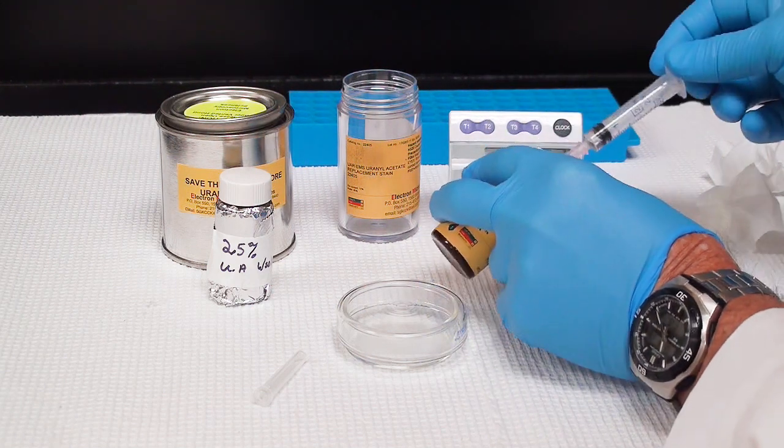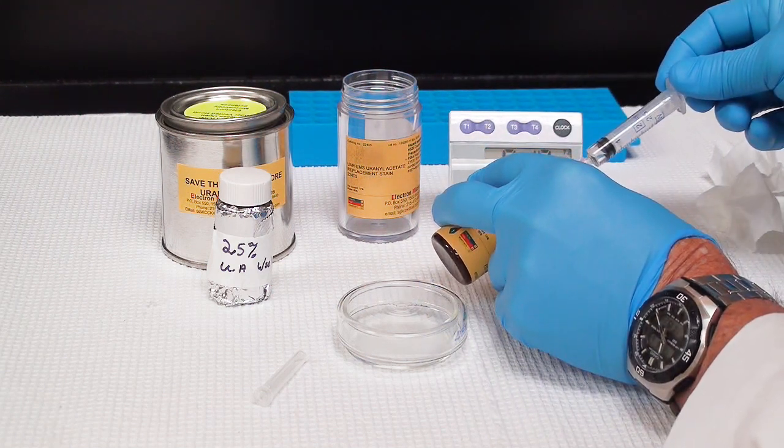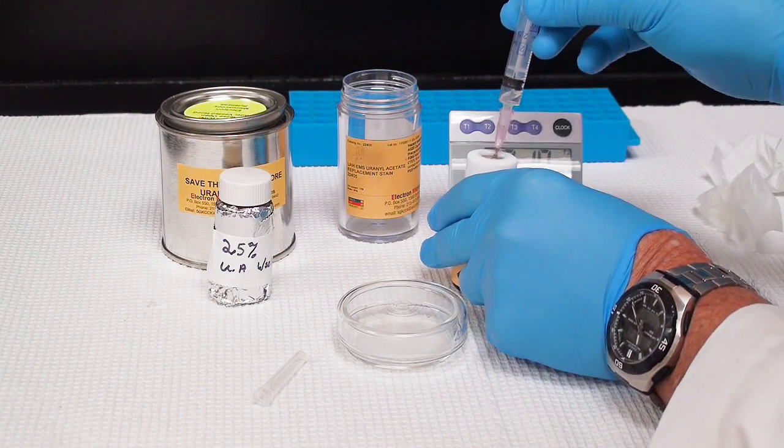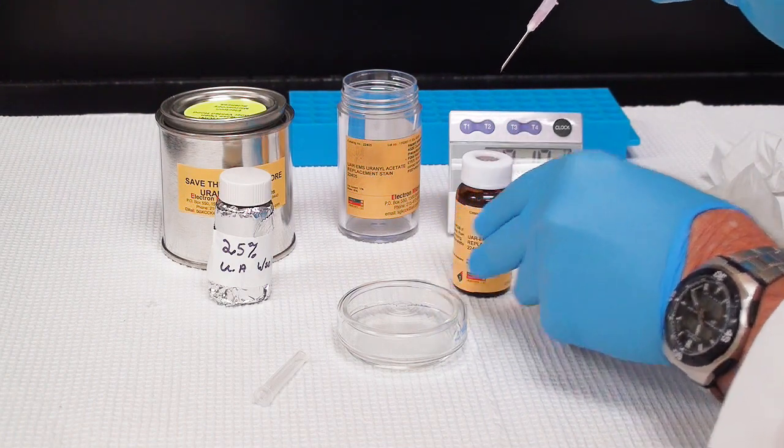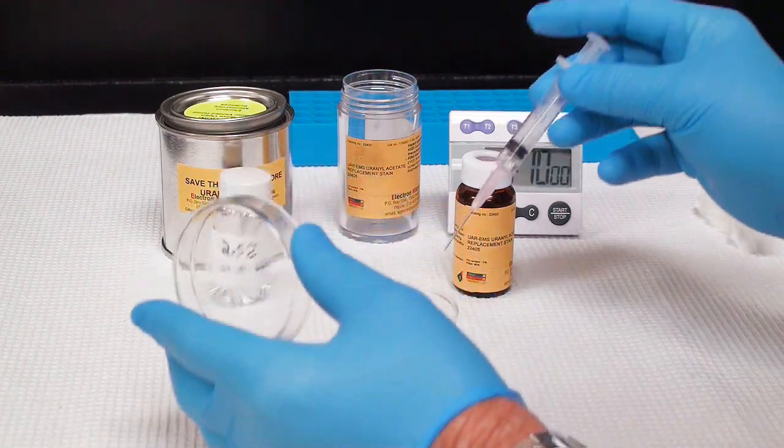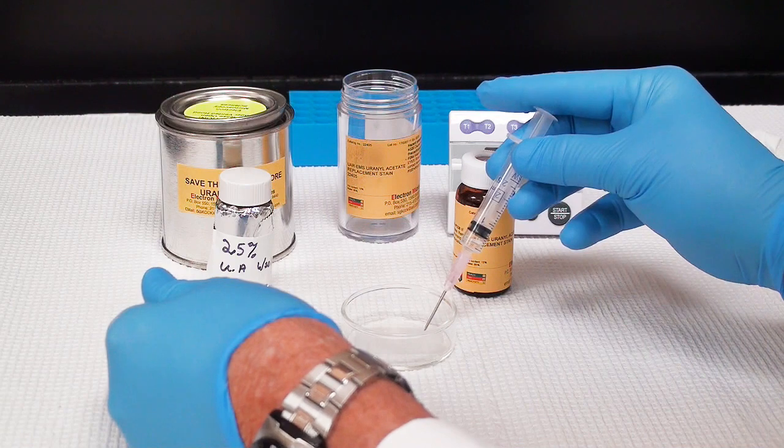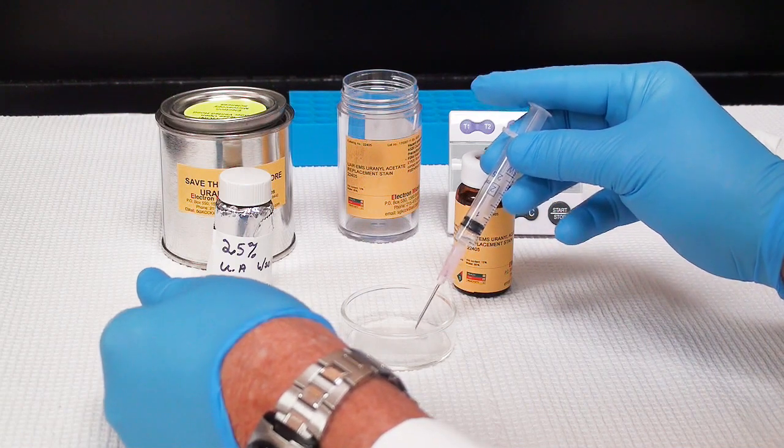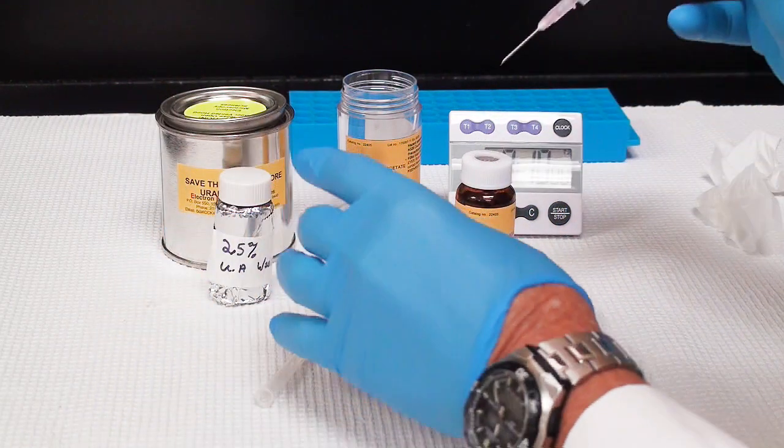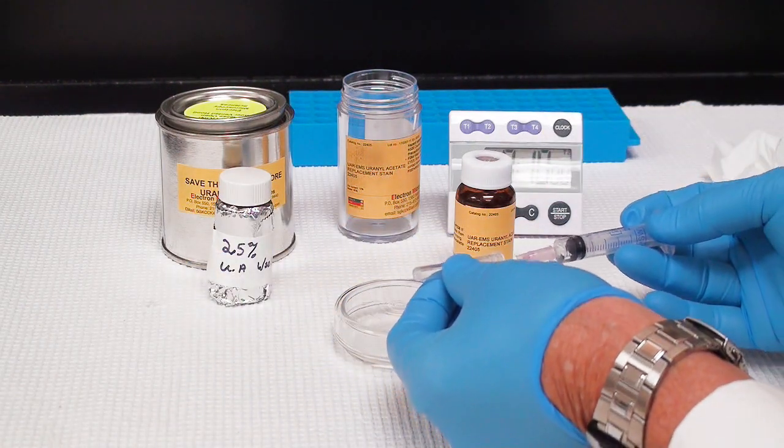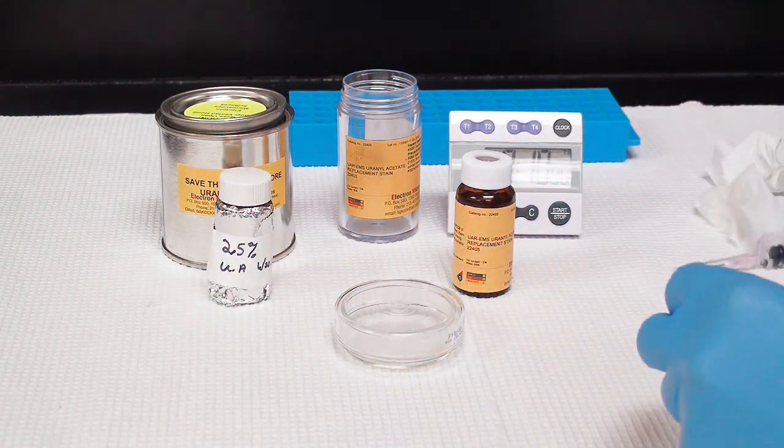To take this out, I'm just going to insert a little bit of air and extract some of the uranyl less out. And just put a drop. I have a piece of parafilm in a staining dish or a petri dish. This uranyl less, you don't have to worry about contamination. I've never had any when I'm using this.